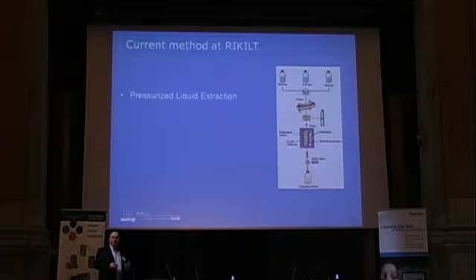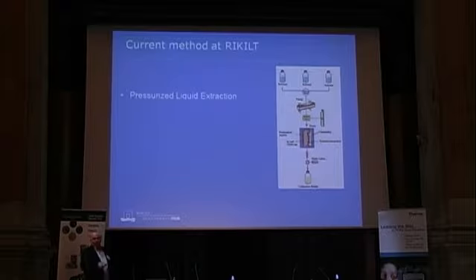So here you put in your sample or your coffee, and your coffee is extracted with water, if you're lucky, and your animal feed is extracted with toluene, and you collect it over here, and then you can continue your analysis. It's a very elegant system. It takes you, let's say, between 15 and 30 minutes, and you use a very low amount of organic solvent.